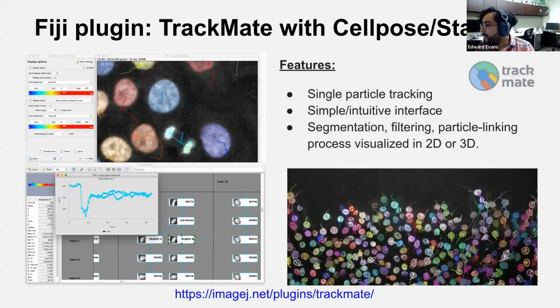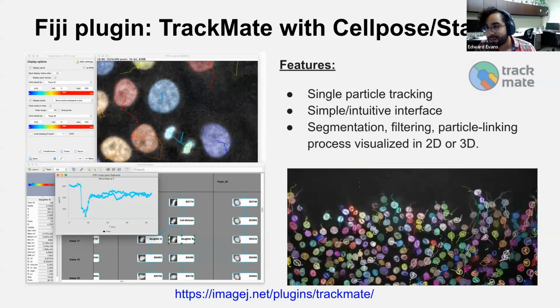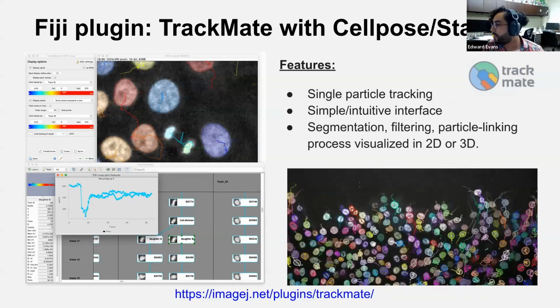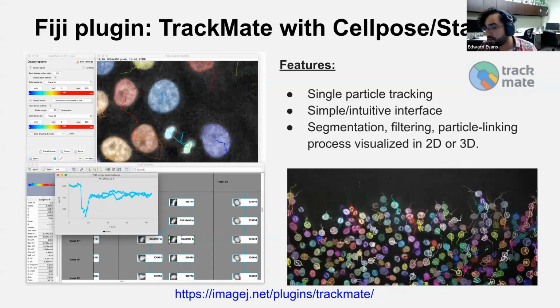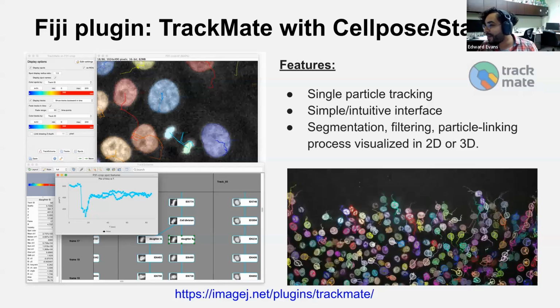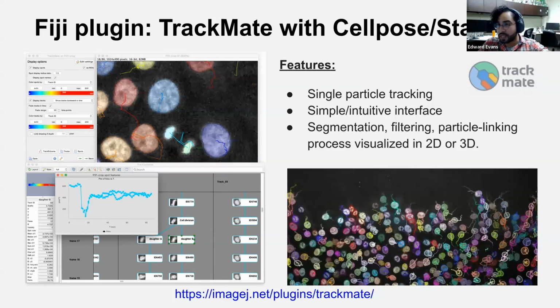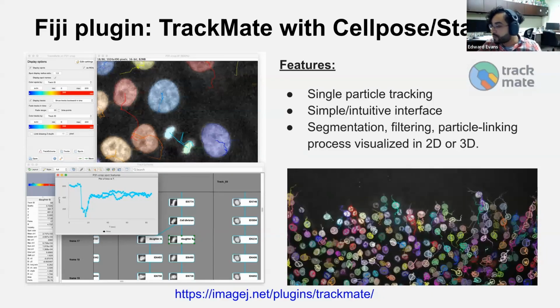And last one here before I want to do a little demo and show you how we can do some classic segmentation is TrackMate. Use it with Cellpose. So Cellpose is a wonderful segmenter that uses optical flow and all kinds of cool things that I like to think I understand, but I don't fully, to segment not just nuclear shapes, but actual cell amorphous shapes.